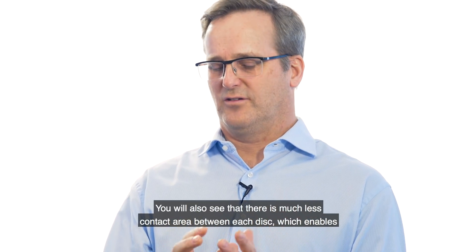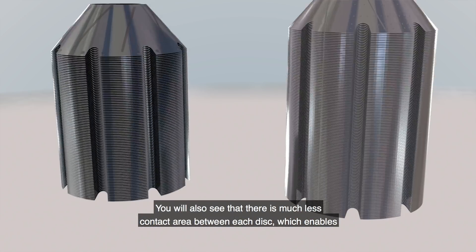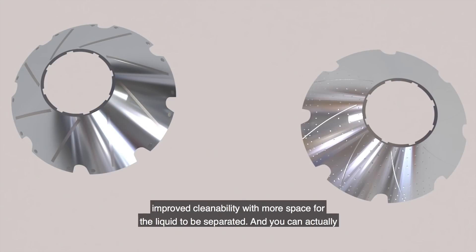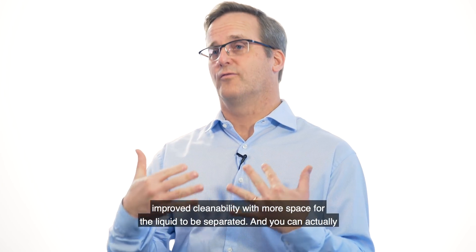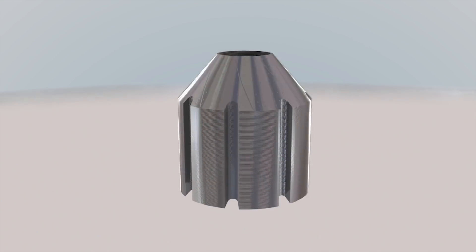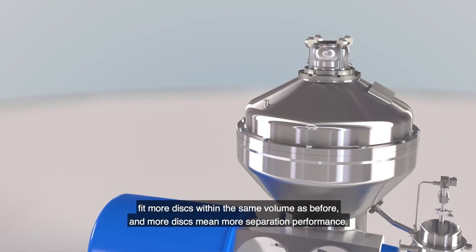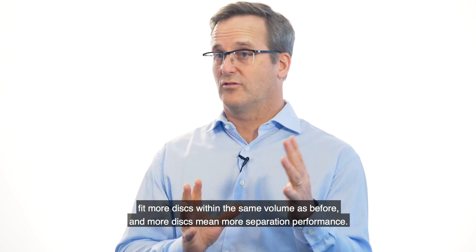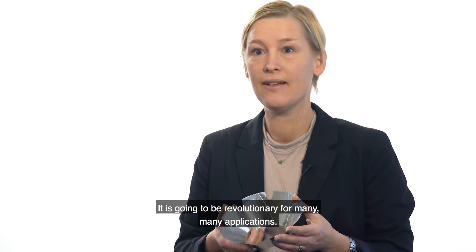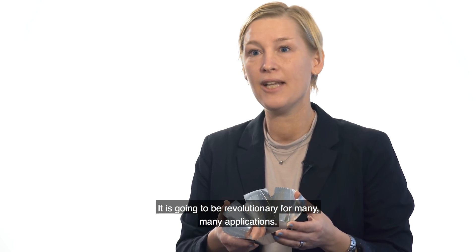You will also see there is much less contact area between each disc, which enables more cleanability and more place for the liquid to be separated. You can actually fit more discs into the same volume than before, so with more discs you have more separation performance. It will be revolutionary for many, many applications.